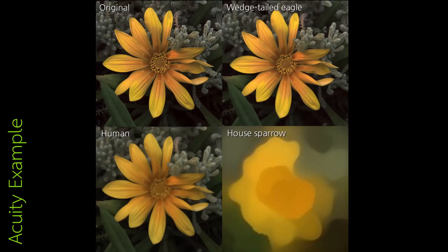This example shows how easy it is to perform an acuity-based analysis modelling the acuity of different receivers at a given distance. Here we have the original image, and we can model how that will look to a wedge-tailed eagle at two metres away — the wedge-tailed eagle has an acuity of about 140 cycles per degree, the highest of any known animal, so it can see almost all of the detail in the flower. A human standing at the same distance, with a spatial acuity of about 72 cycles per degree, would still see a lot of that information. Then finally a house sparrow with a far lower level of spatial acuity would perceive the entire flower as just a few colours — the centre versus the surround.